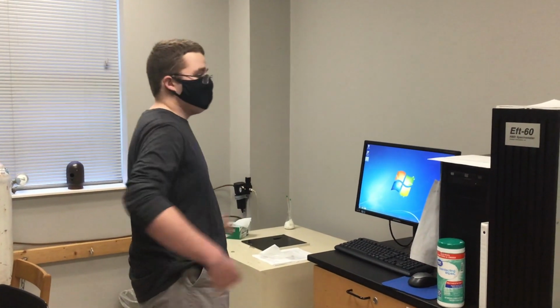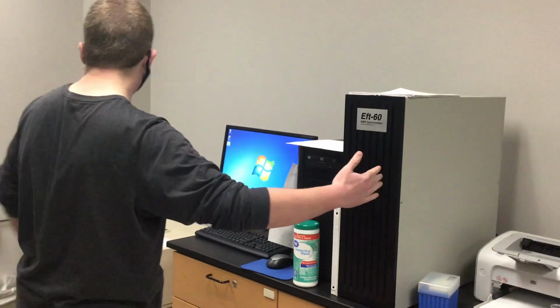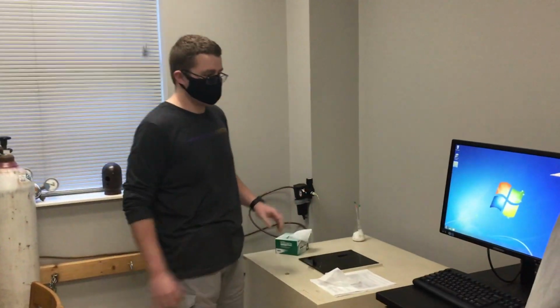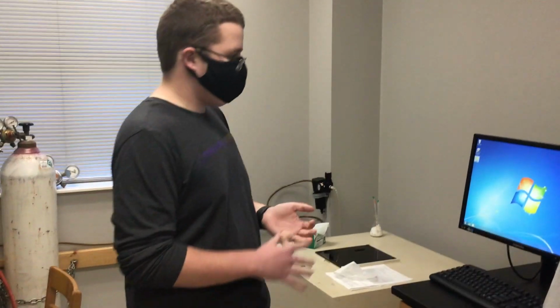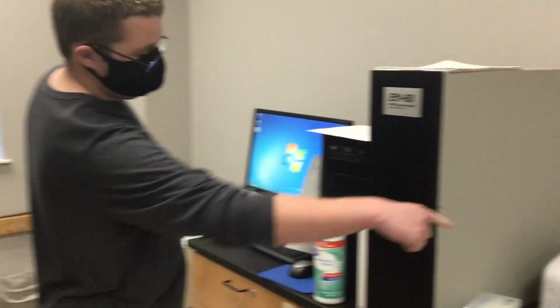Okay, so this week in organic chemistry, you're going to be working with the NMR. This over here is the entire NMR section. It comes from this piece of equipment here all the way to the end over here, and this is the actual instrument that does all the computation. If you need to do any kind of work with this, and that includes printing all of your graphs or anything, all your spectra, you can do that from this computer, and it will print to the printer right there.